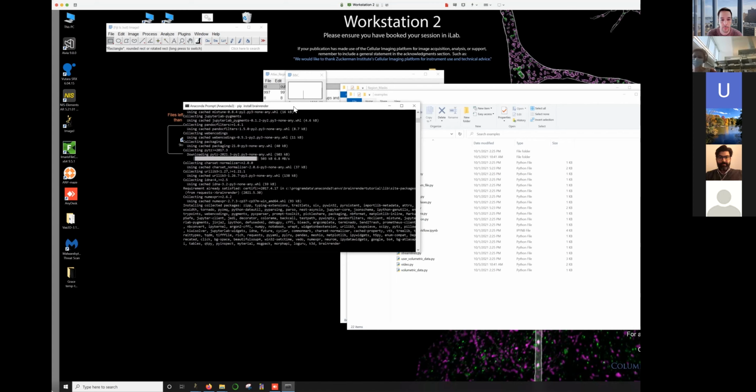Yeah, so actually, while we're waiting for this, if you're working on PC, which it seems like you all are, I also install Spider just as a way to edit the scripts and run the scripts in an easy way. If you're running it on a Mac, Spider can actually break the BrainRender.